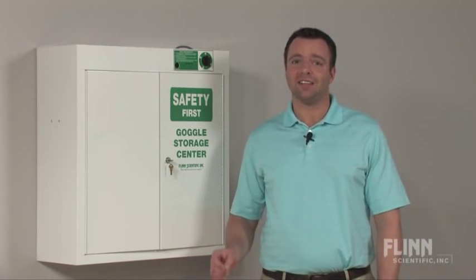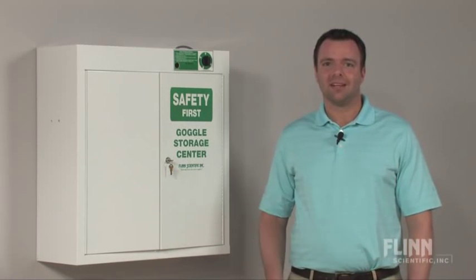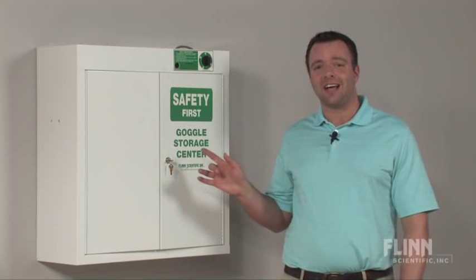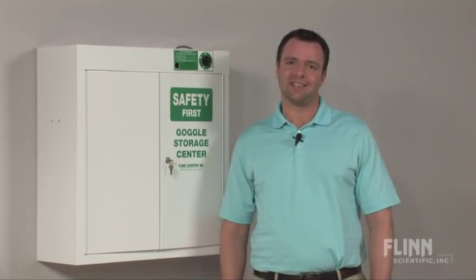Do it with ultraviolet light, just like how hospitals sterilize their equipment. Let me introduce you to the Flinn Scientific Goggle Sanitizer — by far the finest goggle sanitizer made.